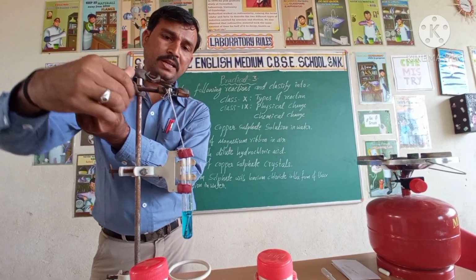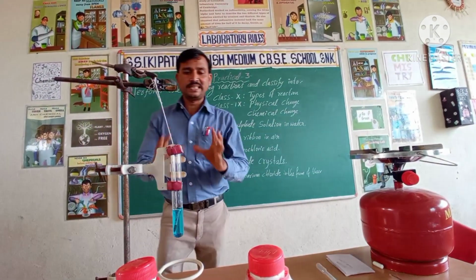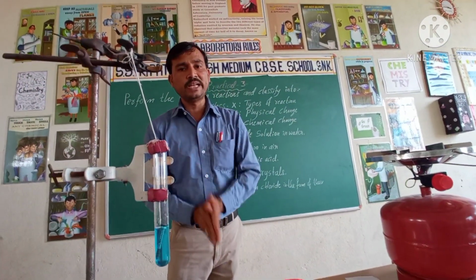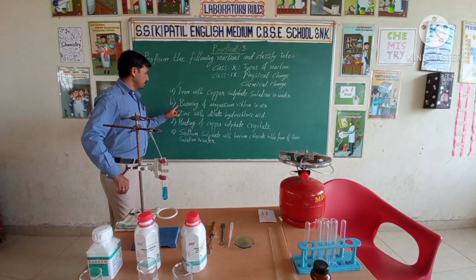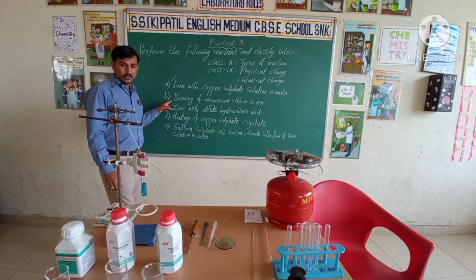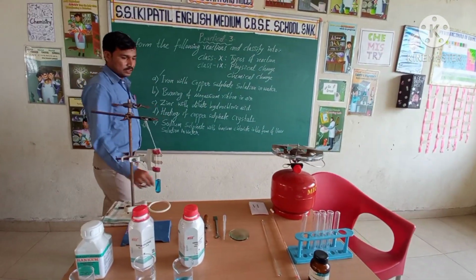Is it dipped in the sulphate? Nice. We'll keep this reaction and allow it to stay for a few minutes so that the reaction can take place. Now, we'll see the second option. A reaction takes time to occur. Now we'll check the second one.